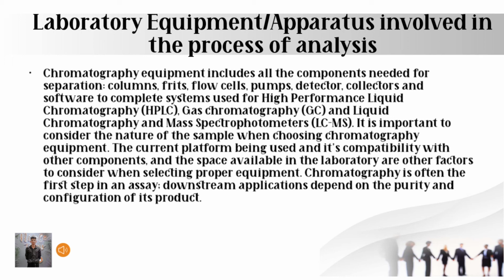It is important to consider the nature of the sample when choosing chromatography equipment. The current platform being used and its compatibility with other components, and the space available in the laboratory are other factors to consider when selecting proper equipment. Chromatography is often the first step in an assay. Downstream applications depend on the purity and configuration of each product.